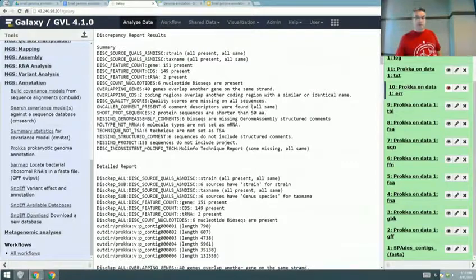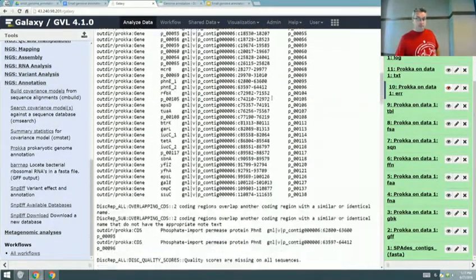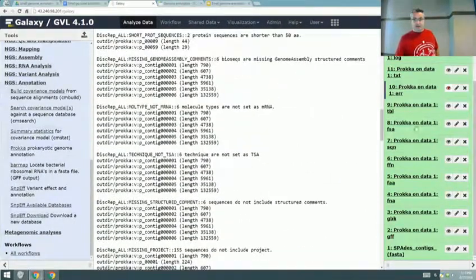Well, the error one, we won't worry about. Oh yeah, we're going through each of the files. Do you want to talk about the error one, the discrepancy report? Maybe. So this is NCBI. They provide a tool that gives you this error report. Most of it's indecipherable. Don't email me about it, please.